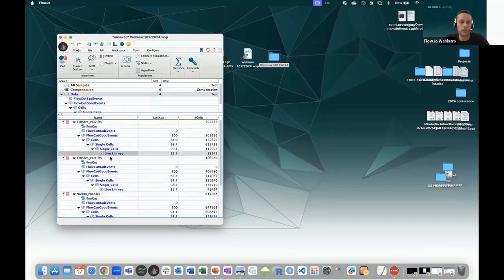All right, so we're done with the cleaning. So now we are on the annotation step. Okay, so step 2, annotation. So let's look at the annotations.